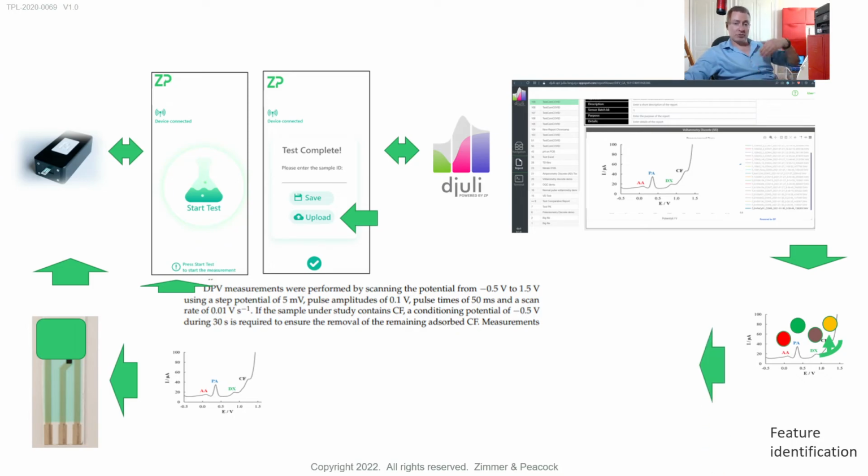The next part is first of all identification, which I call qualification, and then quantification. The database allows us to have, for example, an uploaded calibration graph, and we can then look at things like our peak height and from there calculate what our concentration is.